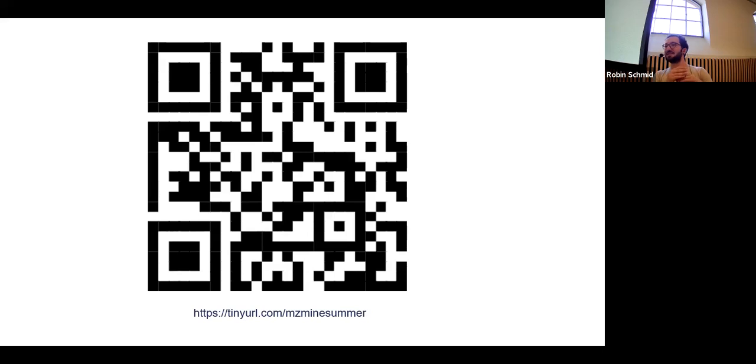We do want to highlight though, because everyone's going to try out and set some other parameters, and there's some downstream analysis that we're going to do the next days, that we also put some files on the GitHub. And maybe I should add the link later. So later we have to go to GitHub and download the exact files, just to make sure that everyone in the same group has the same output files, so that we can use Sirius, MatchMS, MS2LDA, GNPS, all of those tools. Typically, if you have the parameters, you can just rerun and you should get the same output, but we just want to make sure that everyone's on the same page.